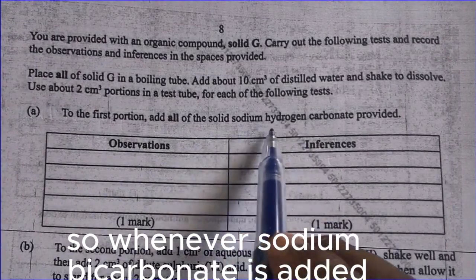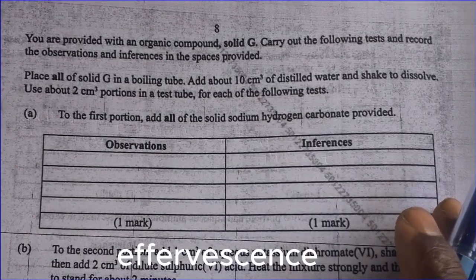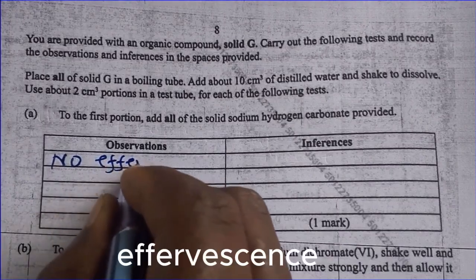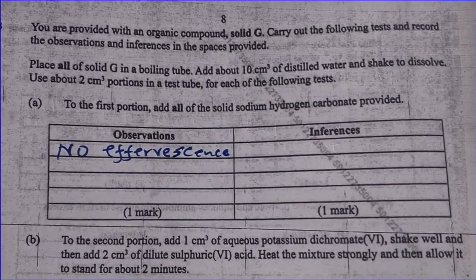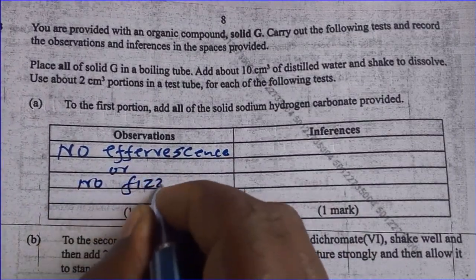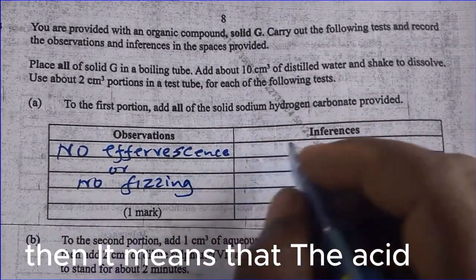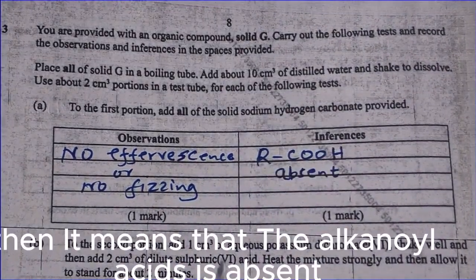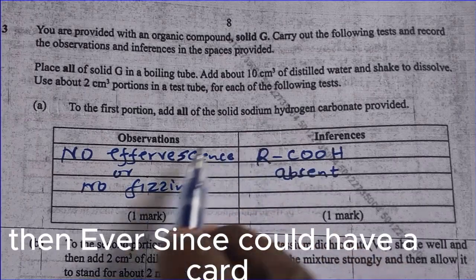Whenever sodium hydrogen carbonate is added, we expect fizzing, we expect effervescence. For this case, there was no effervescence. Or you could write no fizzing, no bubbles. If there was no effervescence, then it means that the alkanoic acid is absent, because if the alkanoic acid was present, then effervescence could have occurred.